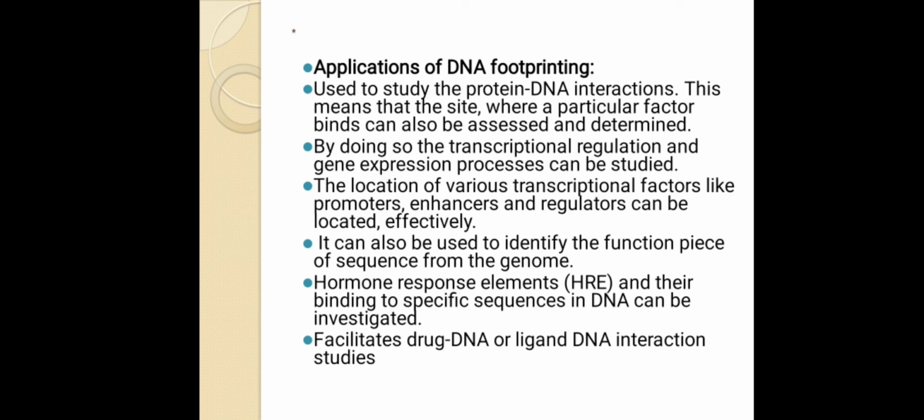And the next one, detection of hormone response elements and ligand binding. Hormone response element is the segment in the DNA, the region which controls the gene expression for hormonal action. Hormones are the chemical messengers which coordinate the entire metabolic processes. For example, thyroid hormone, and so are the steroid hormones. So these hormones, mainly steroid hormones, will bind with the DNA and form a complex called a DNA hormone complex in the particular region called a hormone response element. That region will also be detected by using this technique.